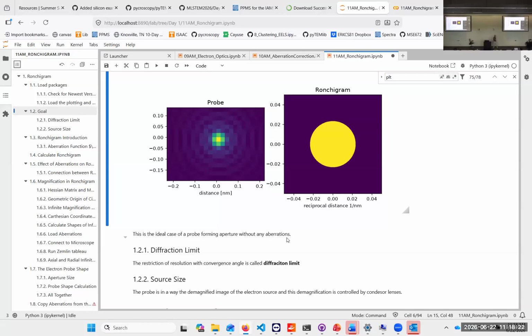So that means the larger we are in reciprocal space, the smaller we are in real space. So for the microscope in STEM mode, the spatial resolution depends on how large of a coherent circle you can form in the Ronchigram that you then use with your aperture to make it small.